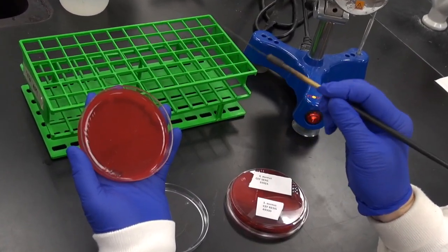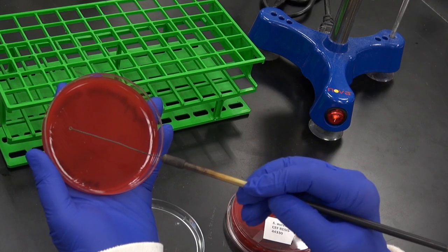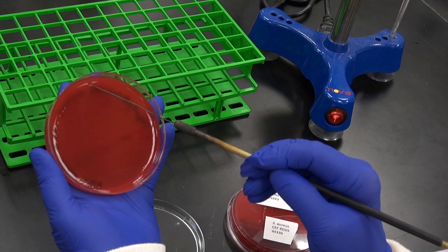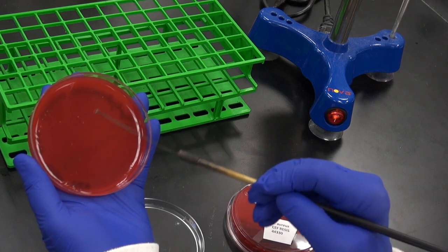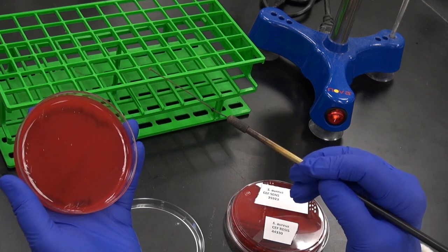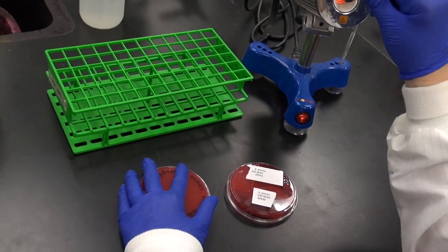Again, streak into the previous quadrant a couple of times, then continue with parallel back and forth motions to spread the bacteria over a third quadrant. Close the plate, heat and cool the loop as before.